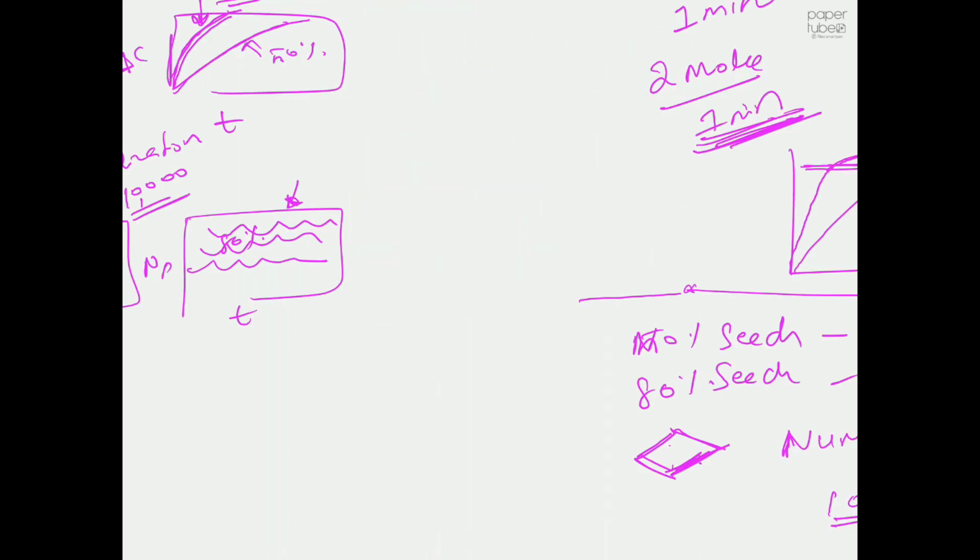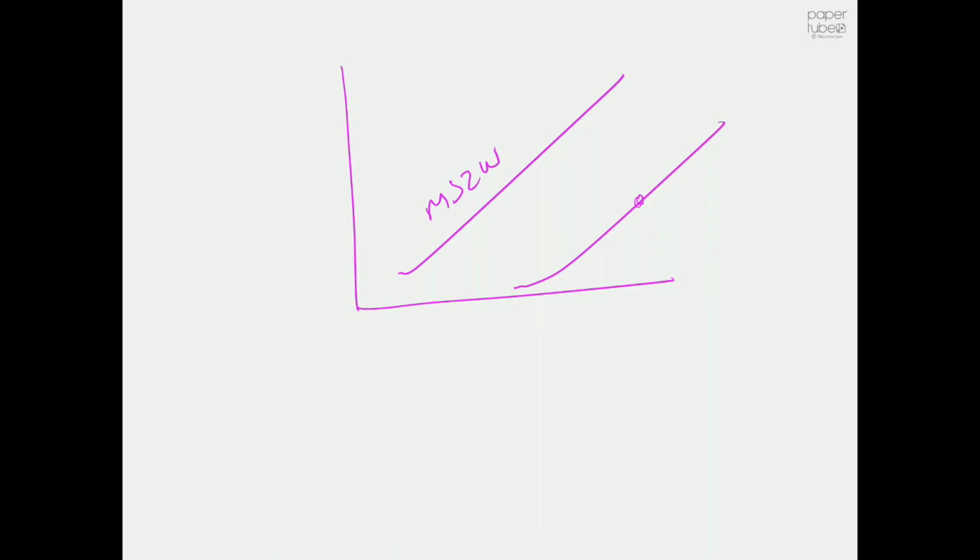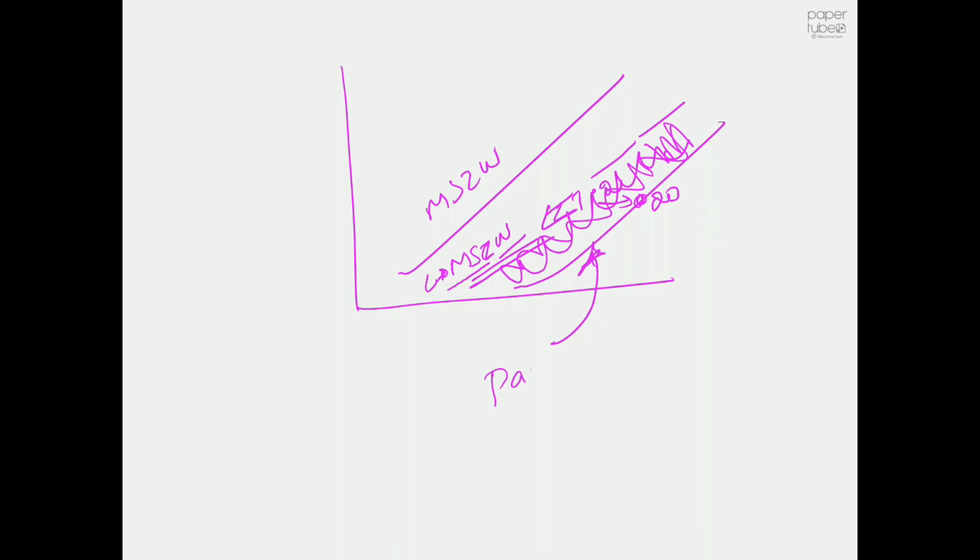And why is this happening? Think a bit about your metastable zone width and solubility. So we are working at 20 degrees centigrade, and at 20 degrees centigrade we have a supersaturation of 1.2. This is much lower than the concentration at your metastable zone width, which means we are somewhere in this region. If you don't understand what this means, watch part 1b in detail.